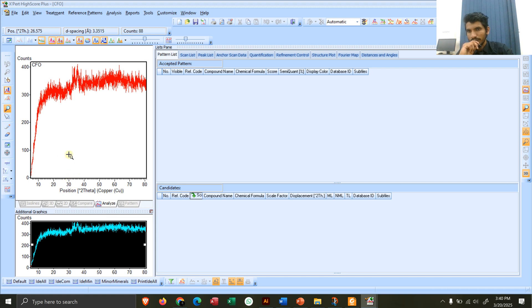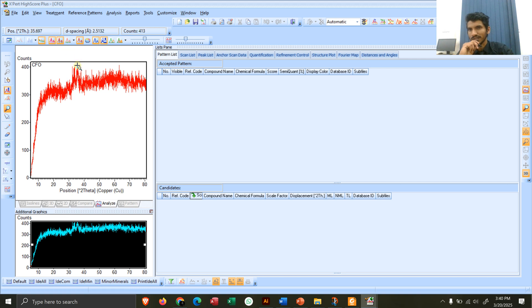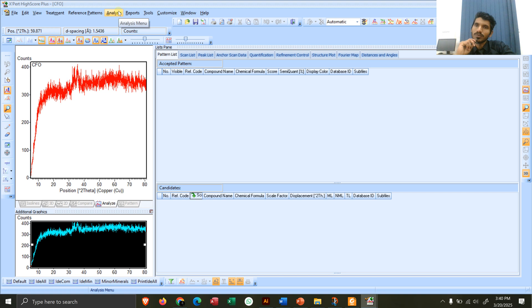As you move the cursor, you can see the d-spacing value and the two-theta value. For example, if I want to find the location of a peak, I move my cursor to that location and I can read its two-theta value — like 36.1 degrees. In this way you can find the locations of the peaks.